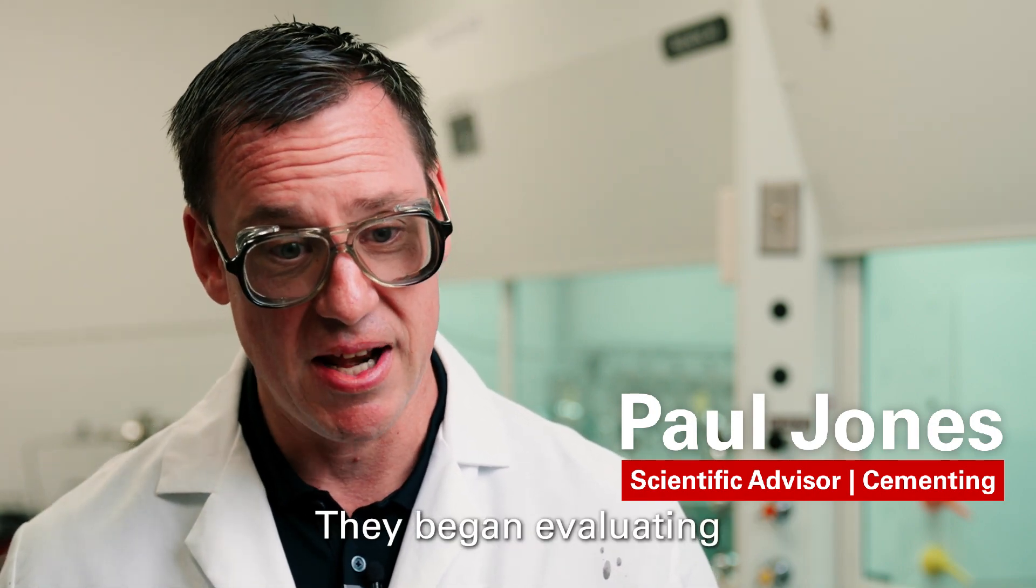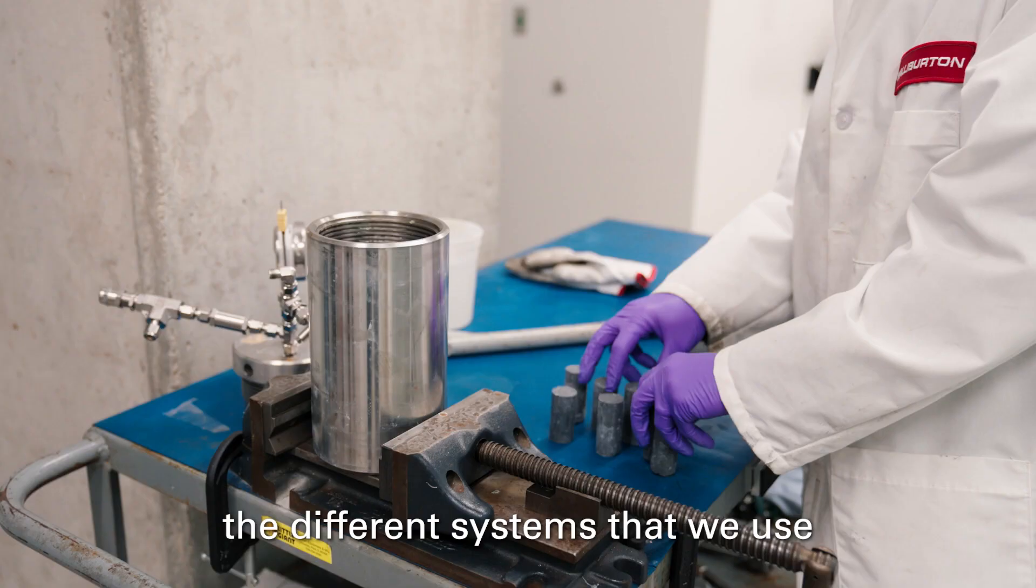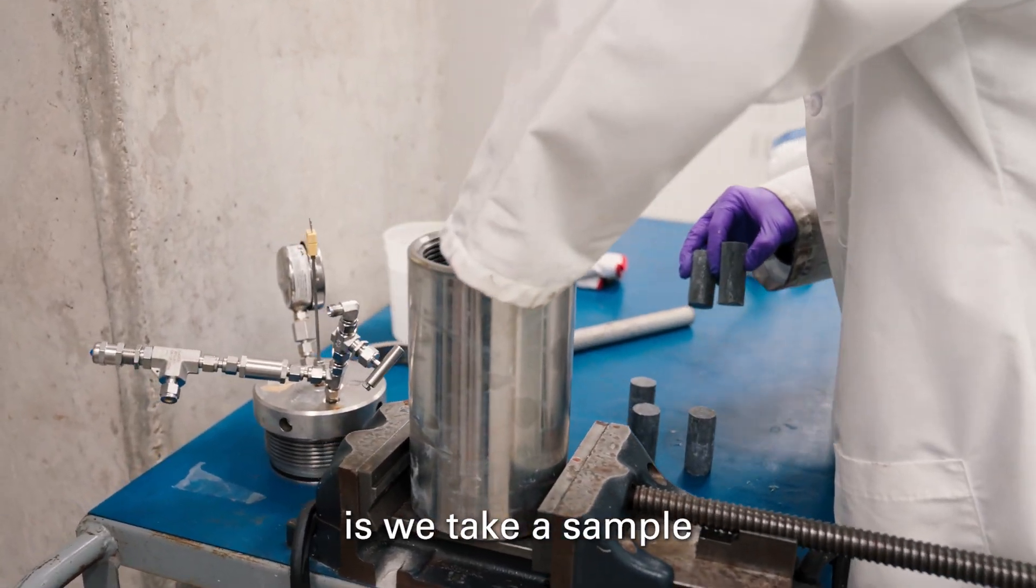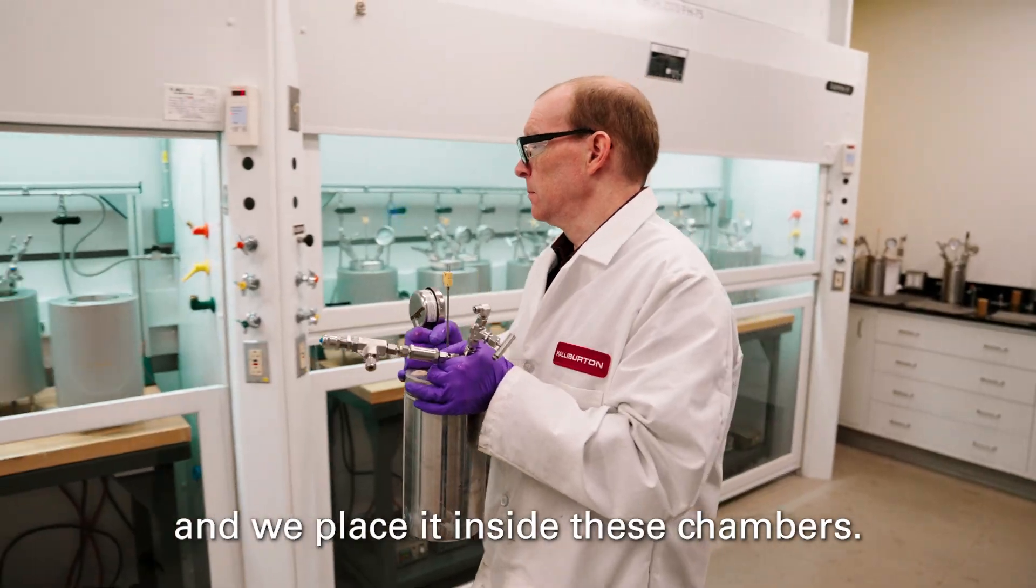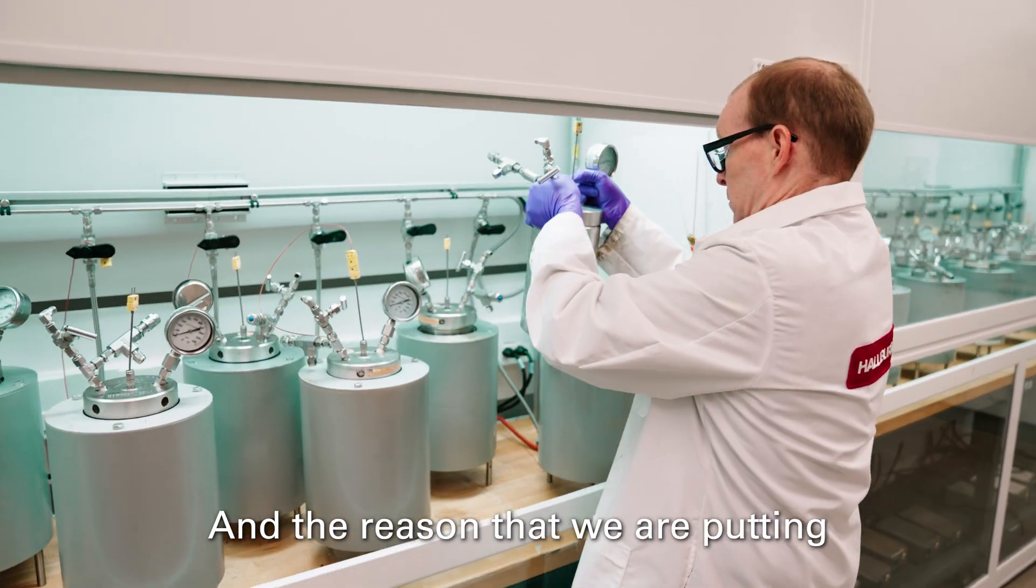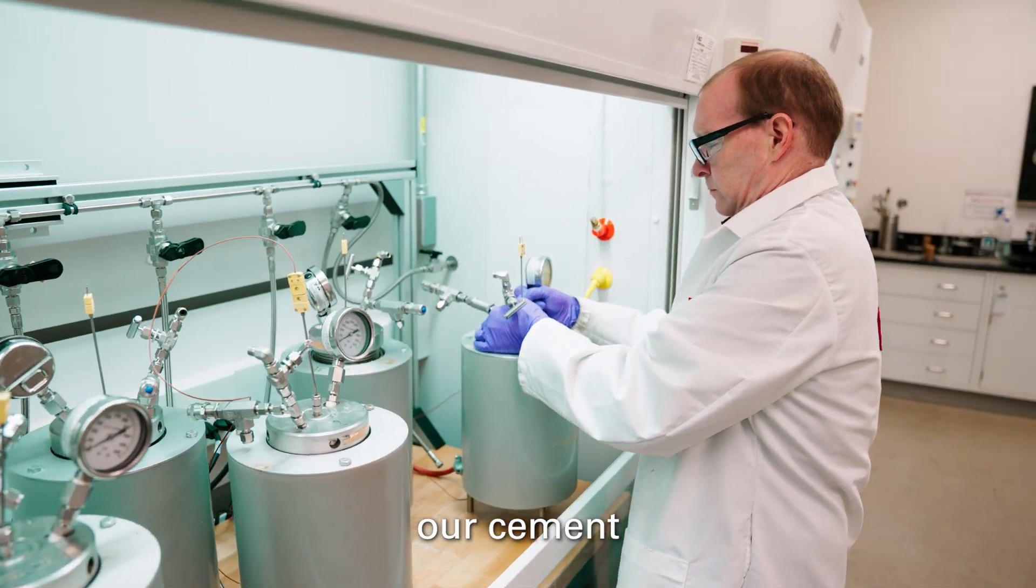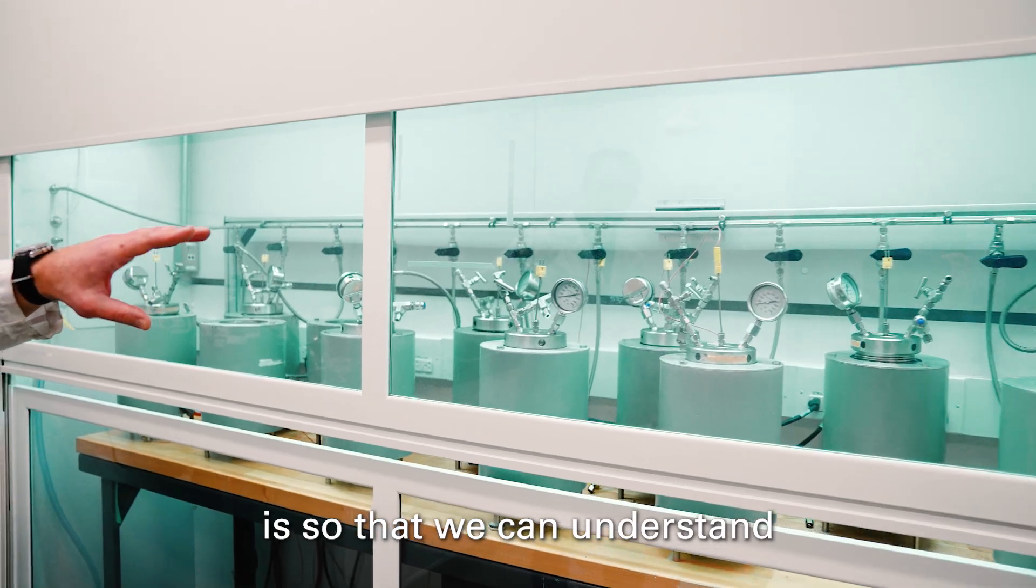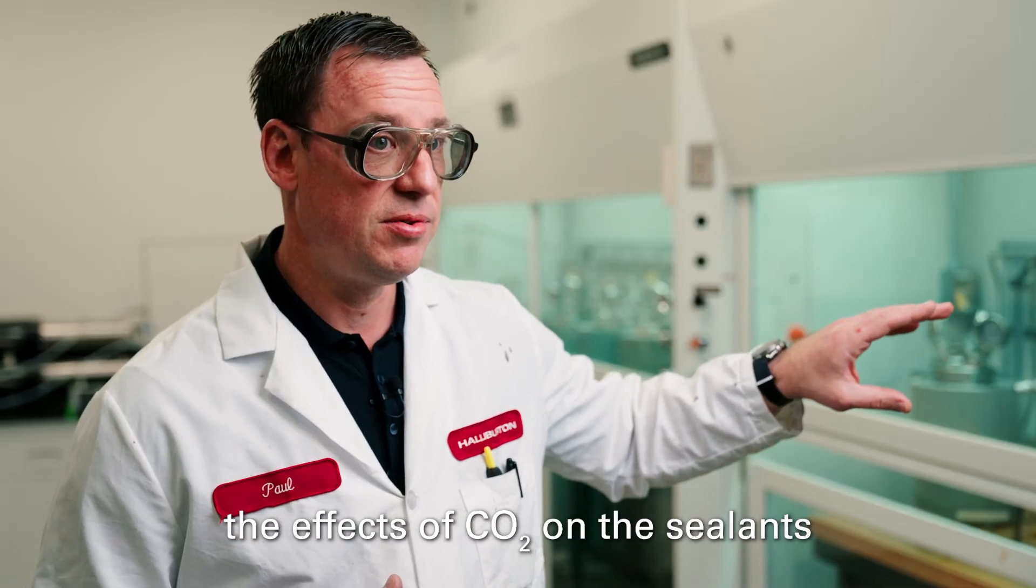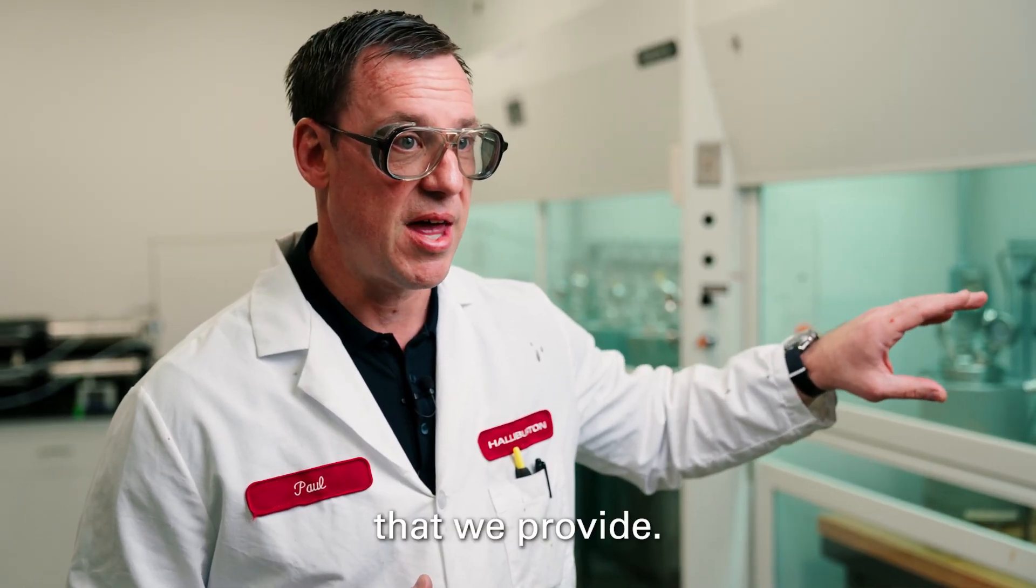They began evaluating the different systems we use. What we do is take a sample of our cured and set cement and place it inside these chambers. The reason we are putting our cement in these chemical reactors is so we can understand the effects of CO2 on the sealants we provide.